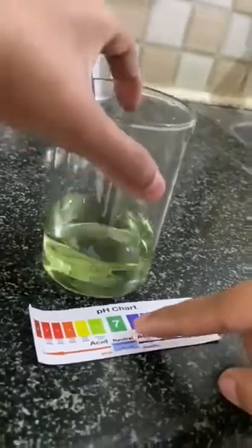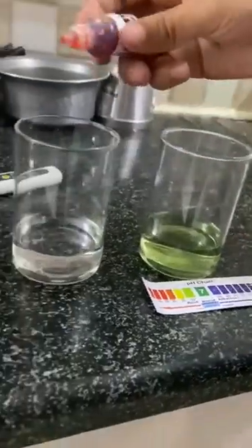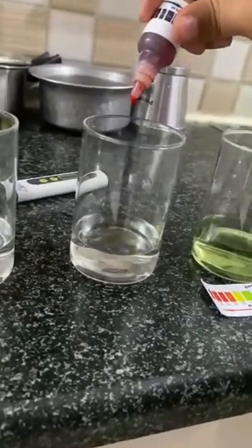More close to 7 — maybe around 6.7. This is the pH for our tap water.